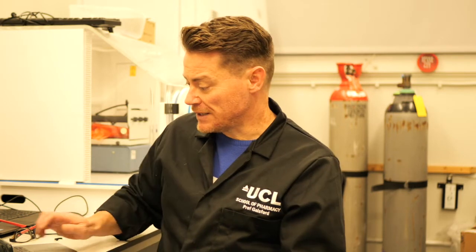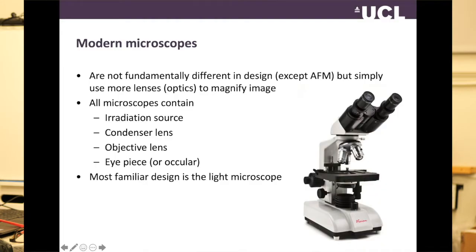And for that reason he's often known as the father of bacteriology, and there is a journal named after him which is still publishing to this day, called the Antony van Leeuwenhoek Journal of Microbiology, for instance. Now, although his system was very simple, it was just a glass bead, he could use it to magnify things up to 400 times, which at the time was a simply amazing level of detail that you couldn't see otherwise. Of course, a modern microscope is very different from the sort of thing that he used. It's much more complicated than just a glass bead, for instance.